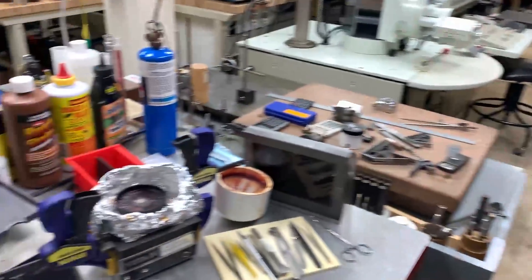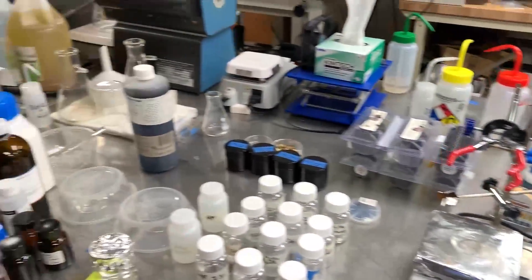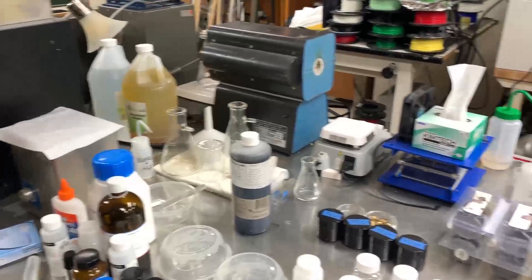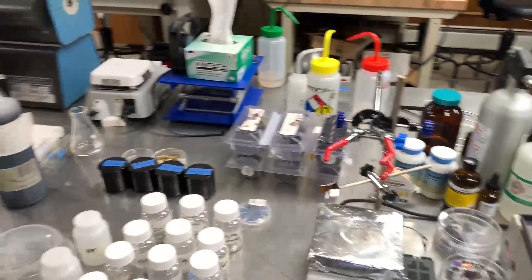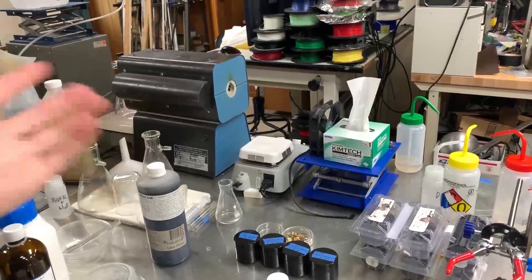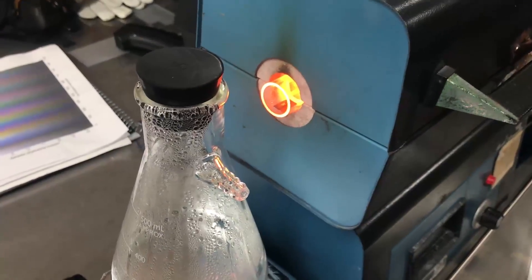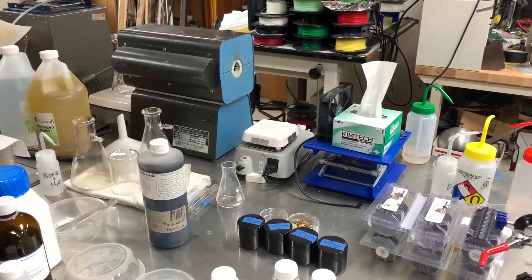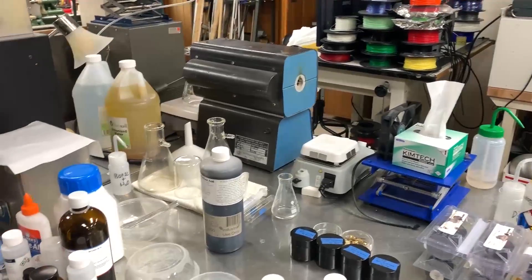In the process of making chips you have to deposit and etch a number of thin films of varying thicknesses onto your substrate. For instance when you're growing an oxide like an insulator onto the wafer you put it in this furnace here and you can guess to what the endpoint will be based on like the time and temperature and humidity.